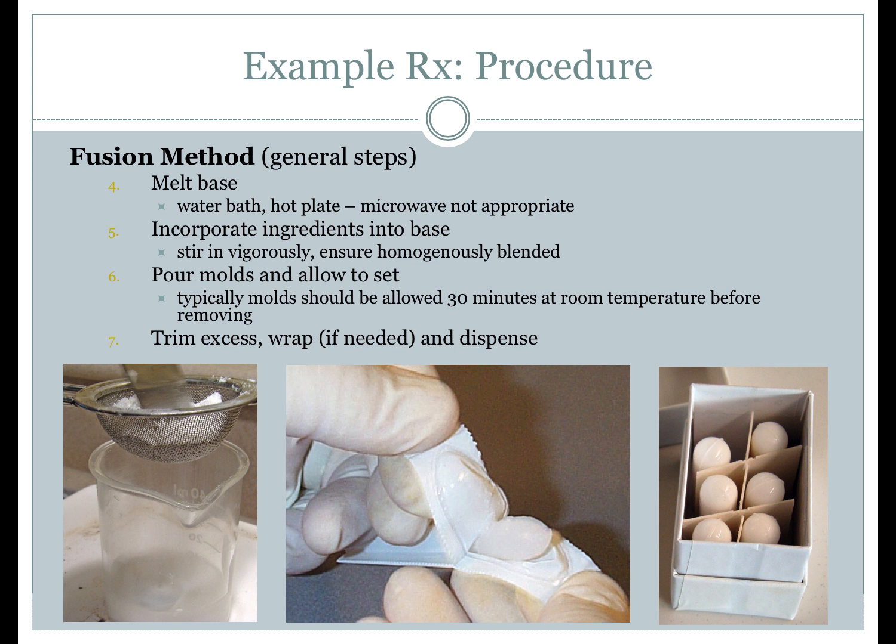However, plastic suppository shells provide extra space at the top to allow for contraction, so they need only be filled to the top. Next, allow the suppositories to cool and solidify. Most suppository bases are solid and can be handled after cooling for 30 minutes at room temperature. Cooling can be accelerated by placing them in a refrigerator, but it is not recommended as the quicker they solidify, the greater the degree of contraction that occurs, as well as making the suppositories excessively hard, brittle, and more difficult to trim to the correct size.